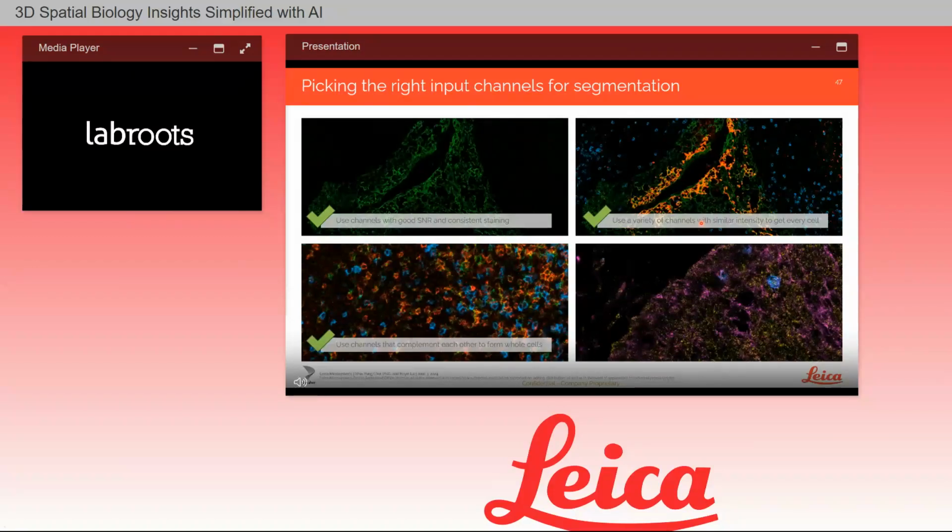Third, as in the case shown in the previous slide, the channels should complement each other so that you can get as accurate of an image of all cells that are on the image.